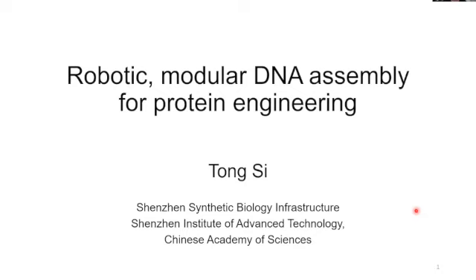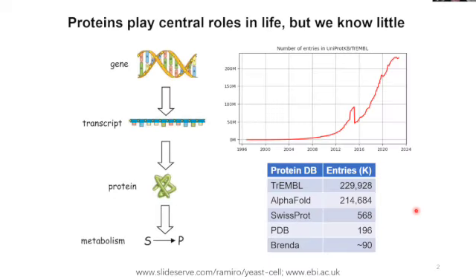So today I'm going to talk about our recent effort in the development of automated DNA assembly for protein engineering. I think the previous speaker has given a fantastic introduction on protein engineering, so I will be brief on the background. So as we know, proteins play central roles in life, and thanks to the advances in DNA synthesis, we are accumulating these protein sequences at unprecedented speed.